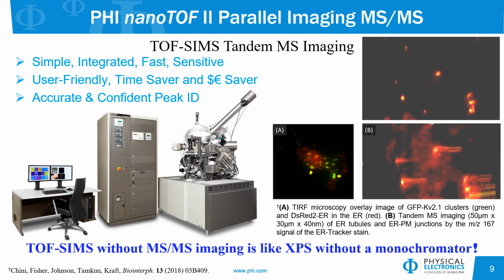For those of you interested in biological applications, the images to the right in this slide indicate 100 nanometer lateral resolution imaging of subcellular structures in single cells. And this data was published in 2018 in the journal Biointerphases. Anyone that's interested in biological applications, I would refer you to that article as a starting point.